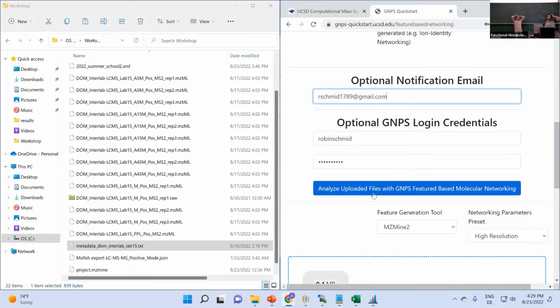It depends very much on your data, and on the load that's currently on the GNPS servers. But it can range from minutes to maybe an hour, maybe 2 hours if there's a lot of load currently going on, or of course, if something goes wrong and it has to get rescheduled. But usually it's, I would say, 10 minutes, 20 minutes, 1 hour.